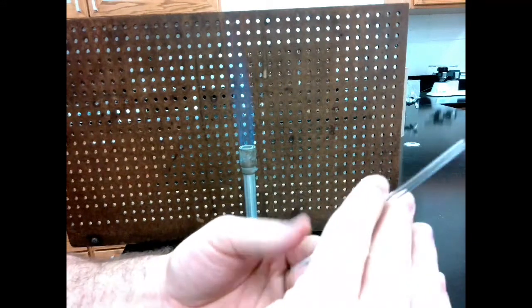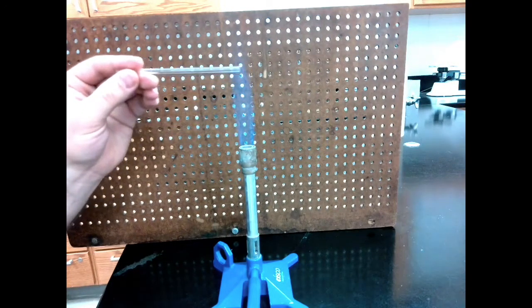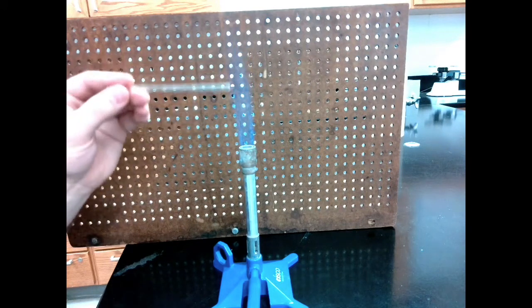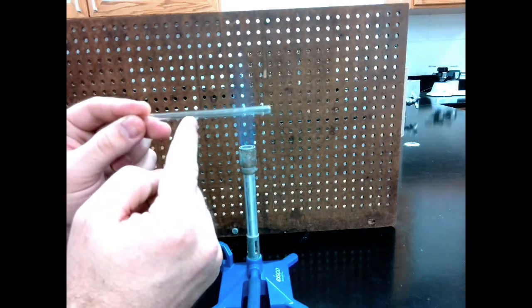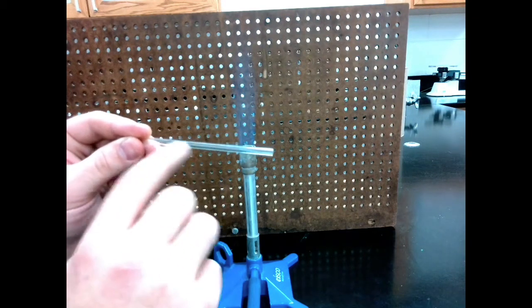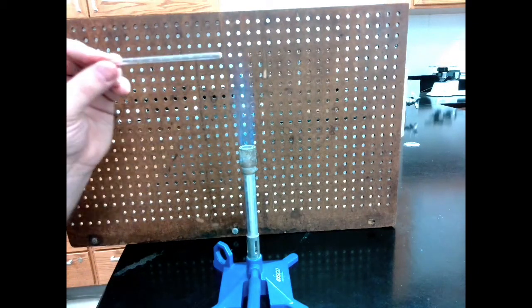Okay, now that my tube is cool enough to hold it on either end, I'm going to be putting it into the flame in order to bend it. In order to do this, I need to put this right at the tip of that flame, where that hottest part of the flame reaches its maximum height. I need to put that right in that tip, so that that tip is going to be heating one part of this glass tube. If I put it any lower, I'm going to be heating two sides of it, and I'm going to get two separate bends, and that is not good. I want to get one single bend.